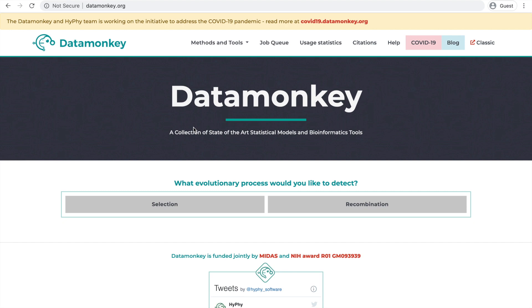Hi folks, I'm Dr. Sadie Wisotsky from the Acme Lab at Temple University, and today I'll be showing you how to use datamonkey.org to run SLAC on an alignment of your choosing.